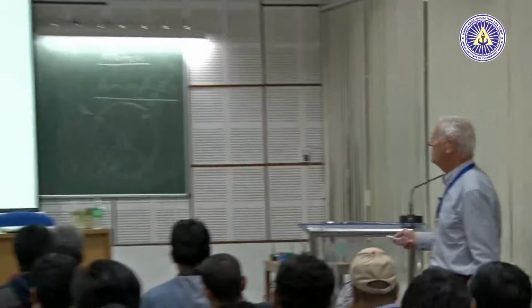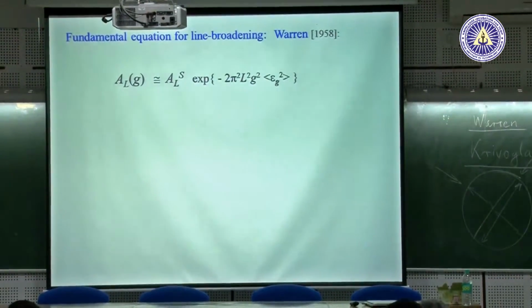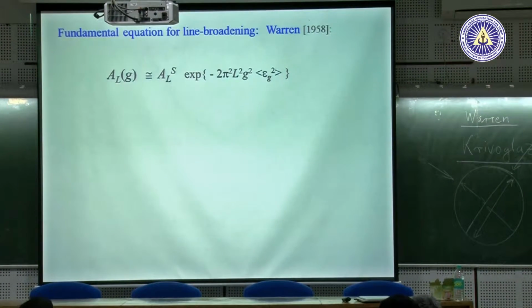Now, if you go to the Warren book, you will find that peaks can be Fourier transformed. Yesterday, I think there was something about that. And the Fourier coefficient of G is the diffraction vector. Okay, so HKL is in G. L is the Fourier variable. Okay, so L is measured in meter.